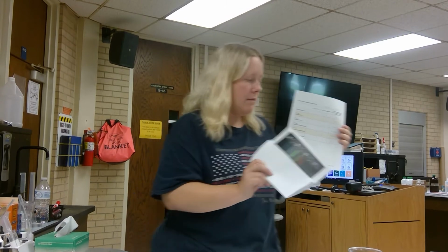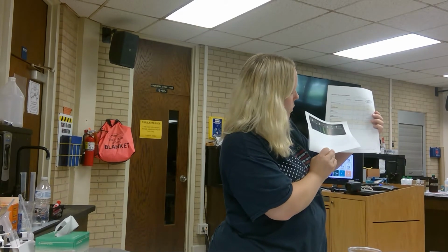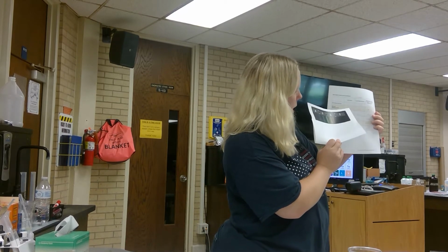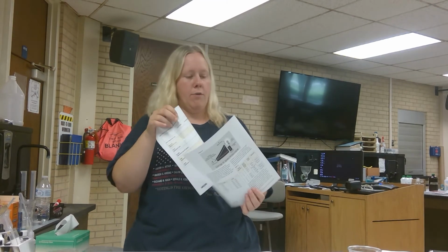Then, I didn't fill in this color part here. Based on these colors, you would fill in that color section right here. So 6.2 would be red, 5.9 would be orange, 5.4 green, turquoise, and violet here. Now where I got these numbers, this column here, is from table 2 in your experiment. So refer to page 5 of your lab.